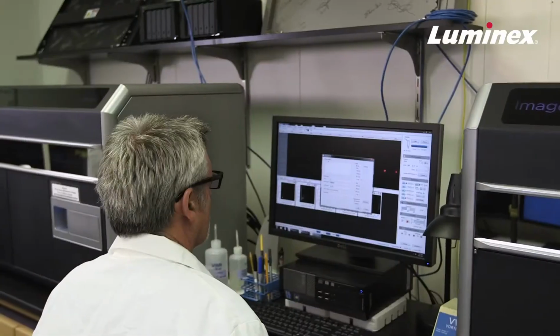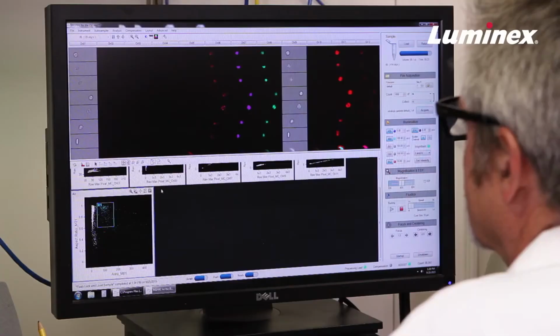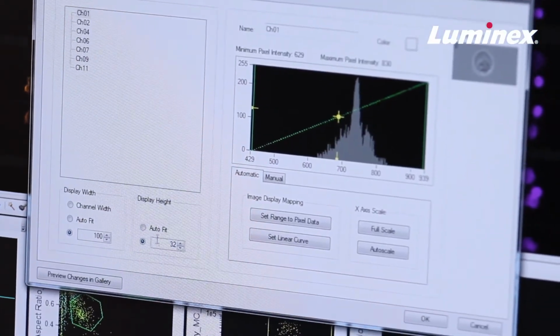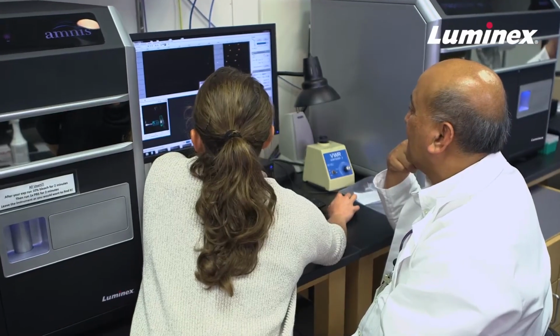One of the really interesting discoveries that we made using the ImageStream involved circulating tumor cells. Circulating tumor cells are of a lot of interest to many of the investigators here at Roswell Park. We developed this fluorescent in situ hybridization technique with the ImageStream, and we've been able to detect the presence of abnormal cells in patient samples, patients who were considered in clinical remission, so no pathological evidence for the presence of abnormal cells, but yet with the ImageStream we were still able to detect in very low numbers the presence of abnormal cells.